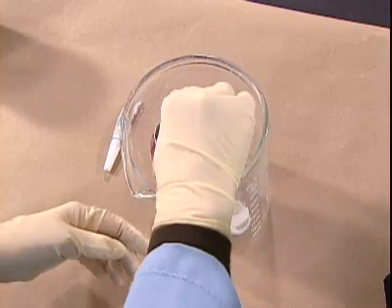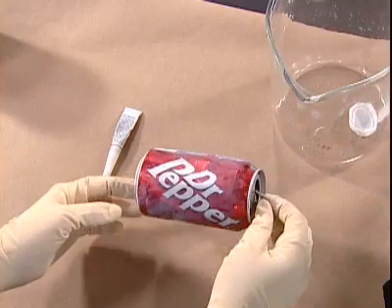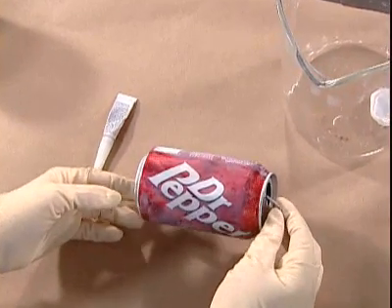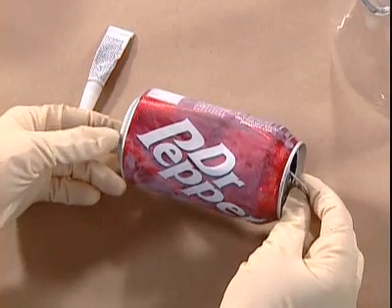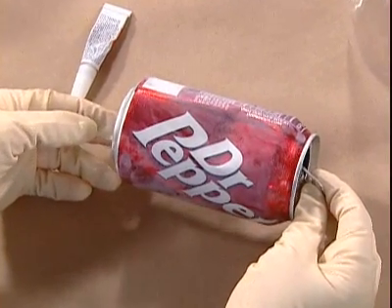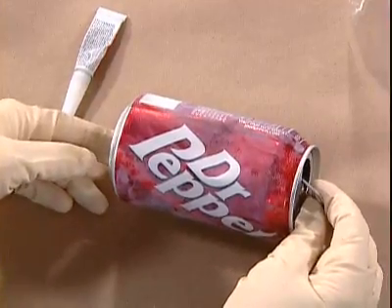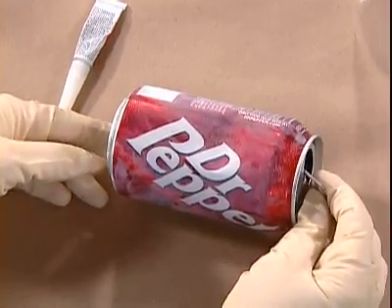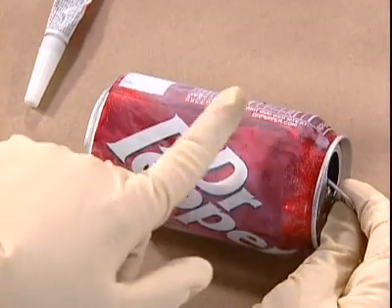And we can see that the can now has a fine coating of what looks like a white film on its surface. And what has happened is the latent fingerprints, the oily residue, has been covered with the white superglue fumes. And there appears to be a pretty good latent in this area.